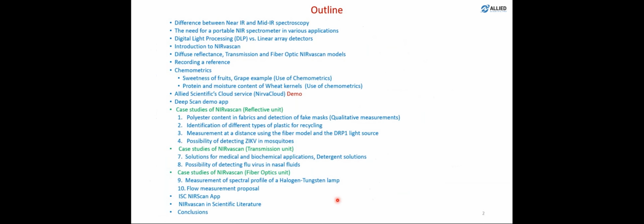These micromirror arrays are a matrix. So I think I mentioned what the dimensions of that matrix are: 854 pixels. I guess somewhere it was mentioned, 854 by 400 and something. I don't find it right now, but it's a matrix. So in the column mode, you would only activate one column.